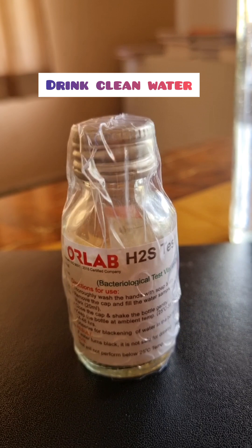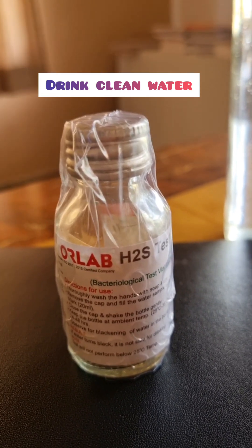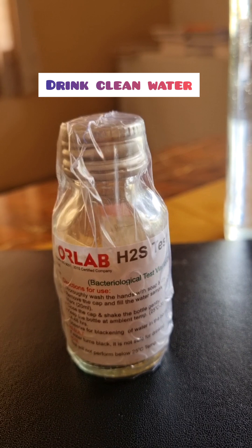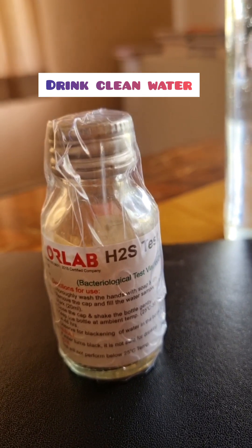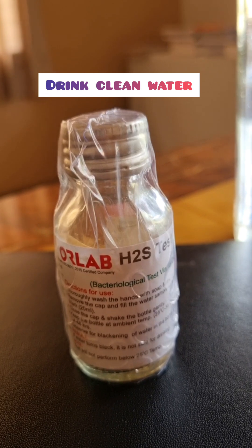If it's clean or yellowish, it is a very nice thing — you can happily consume it. It is safe to drink. So I would recommend everyone to buy and test this once, because now RO is like a purifier.